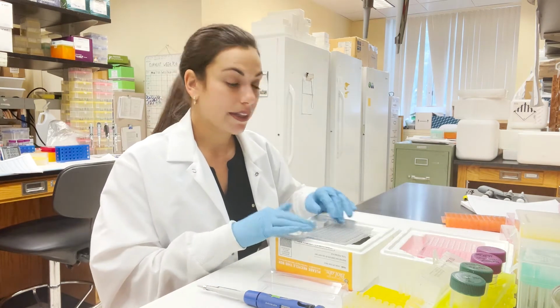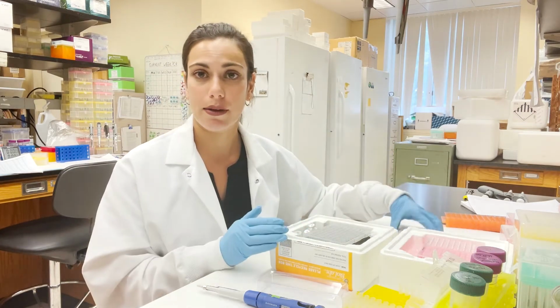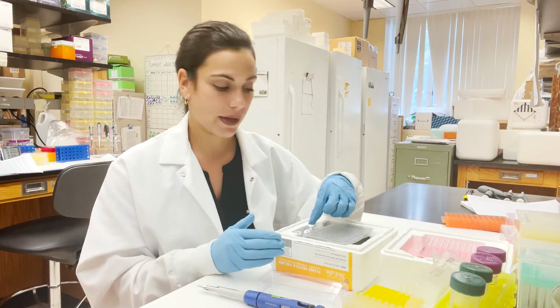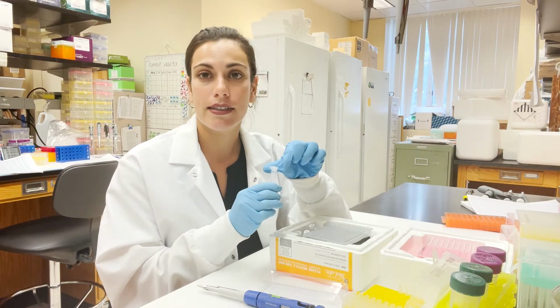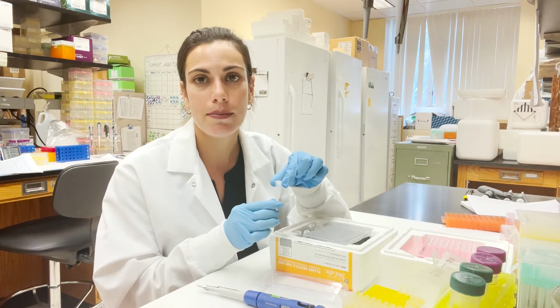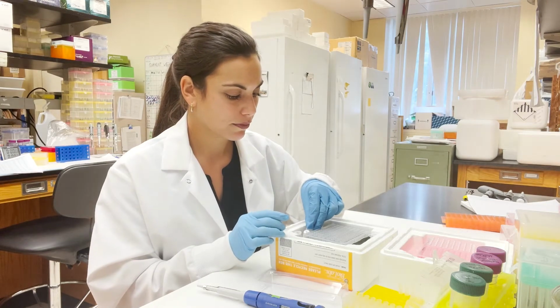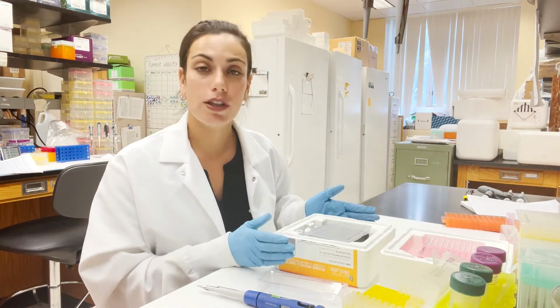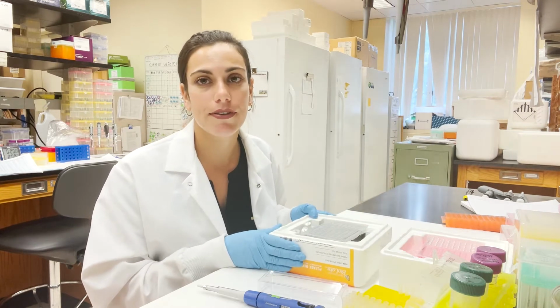And then also on the other end of the fragment, so we have the barcodes on one end of the fragments that we've digested, and then on the other end we have our common adapter. And what the common adapter does is it relates to our primers that we'll use in the PCR step, and it will amplify based on that.